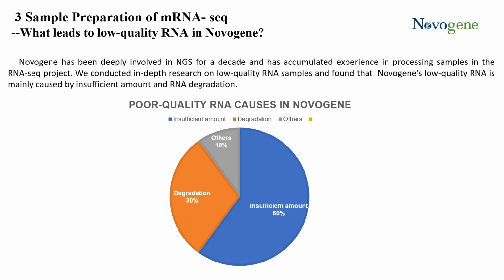As you all know, based on the initial QC criteria, we evaluate your total RNA samples to be either pass, failed, or hold. Any sample that has been given a pass means technically the sample has good quality as well as quantity of RNA. Any sample that has been evaluated as hold or failed.